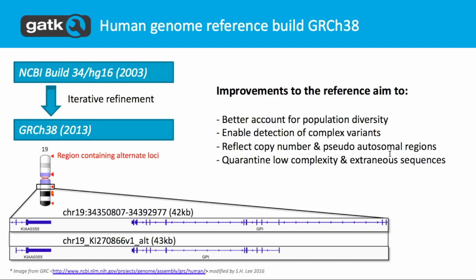It also shows the different haplotypes of the population, not just the one most common haplotype that occurs. So yeah, the data that aligns to GRCh38 is of somewhat better quality than HG19.